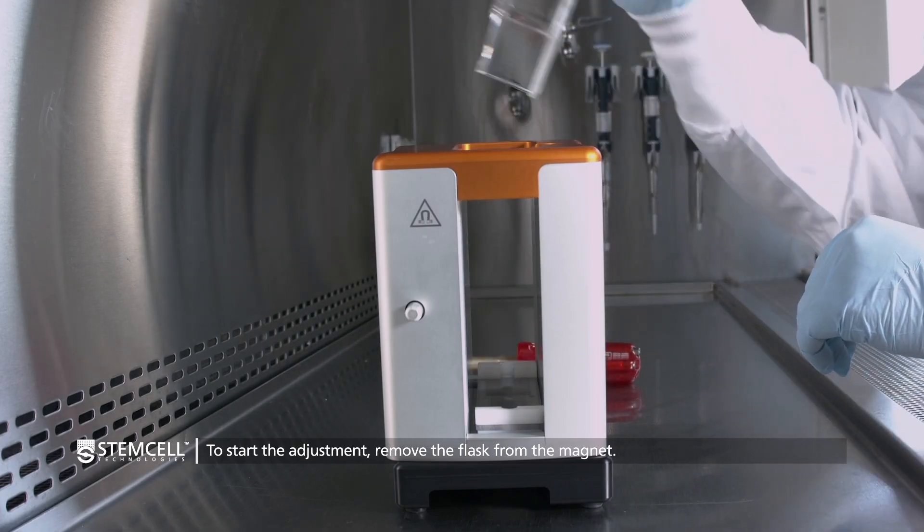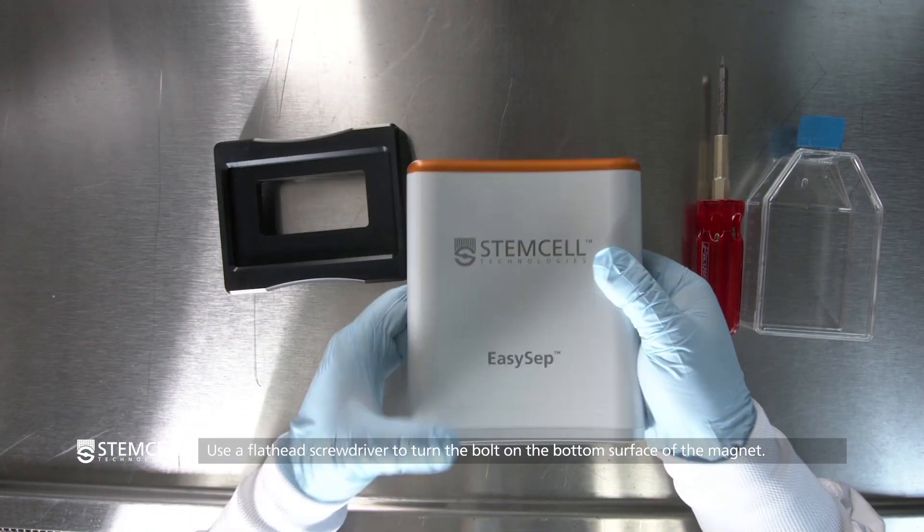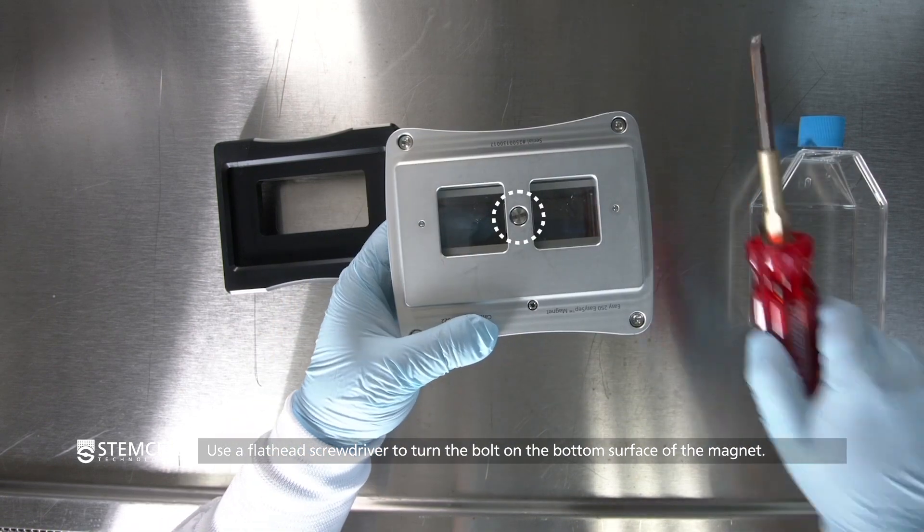To start the adjustment, remove the flask from the magnet, place the magnet on its side or upside down, and use a flathead screwdriver to turn the bolt on the bottom surface of the magnet.